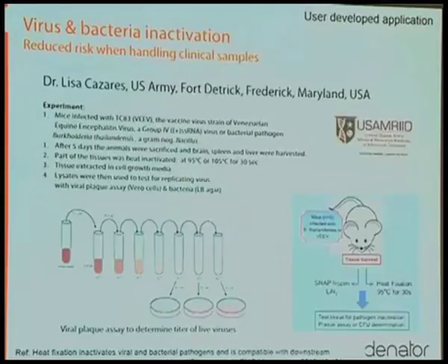And in order to get samples out from there, she had to put the samples into formalin for 21 days. And after that, it was practically impossible to do any sort of molecular characterization of these samples because everything was so tightly fixed in the sample.